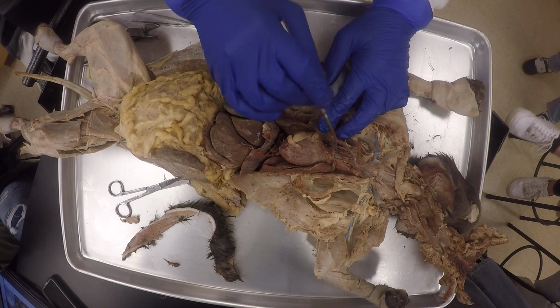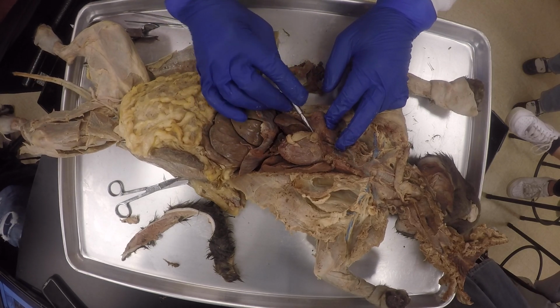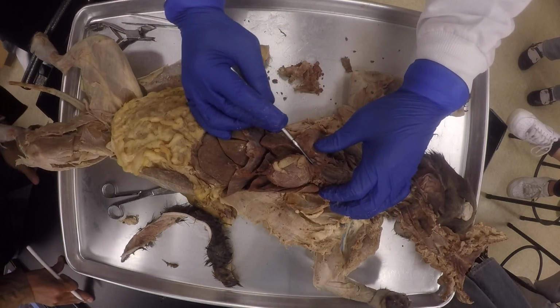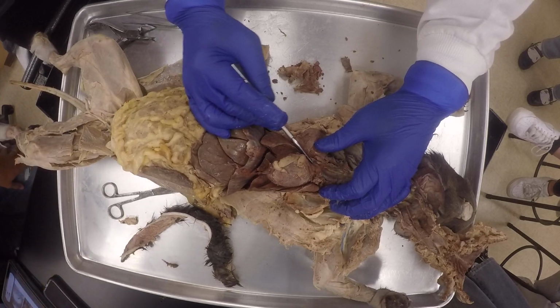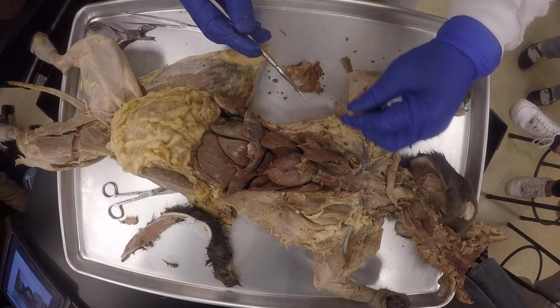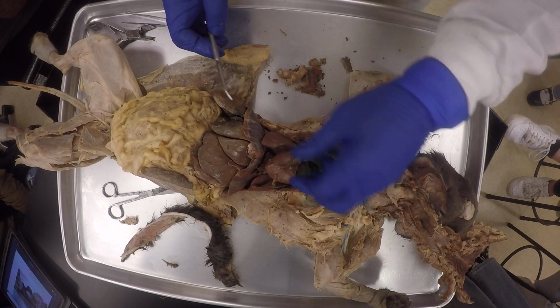Do you feel me? Okay, so obviously this will be the azygos vein. Right there. I see it, but it's hard to see on this one. Now I'm going to remove the epicardium so we can expose the left and right primary bronchi. Is that cool? Very cool.